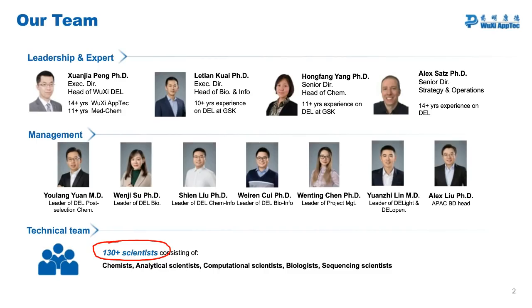This question asks, is it possible to complement an internal DEL collection with the WuXi DELight collection and run the DEL screen with both collections together? The internal collection will be blinded for WuXi, and the WuXi collection will be blinded for the company. Do you know if PCR and sequencing are working, mixing two DNA designs in the same pool?